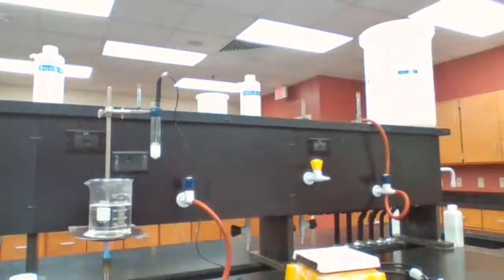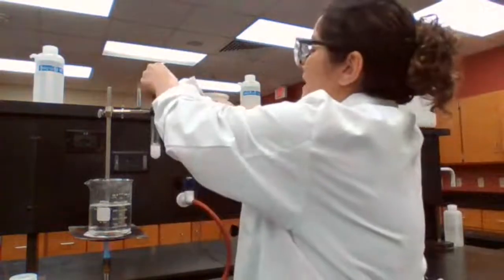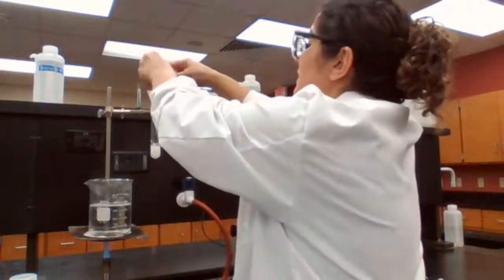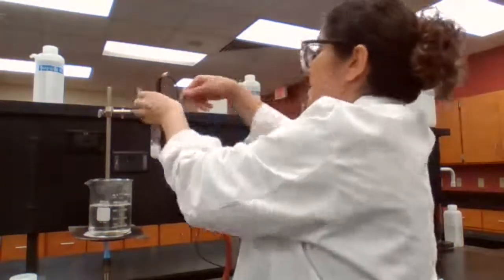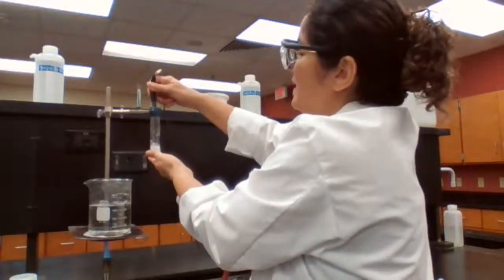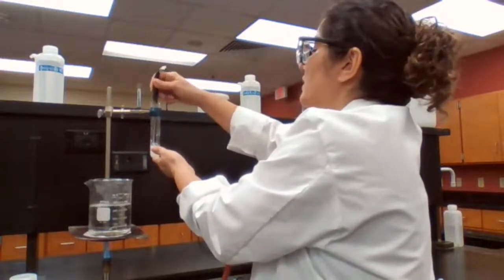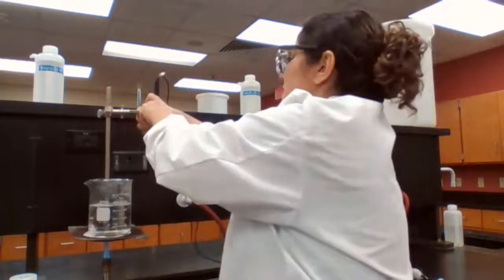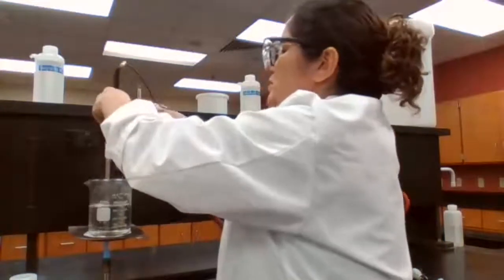Now we are going to add the 0.8 gram. So the next step, we are going to add the 0.8 gram of the solute, and I chose unknown letter C. So when I add the solute, now I have a solution. A solution doesn't always have to be liquid. You could also have solid in solid solution. We are going to place it back in the hot water to change to liquid.